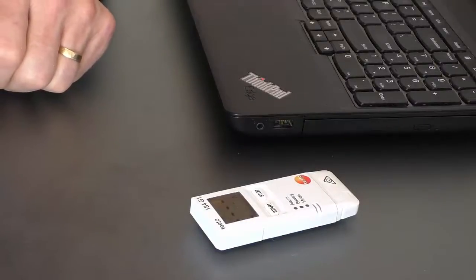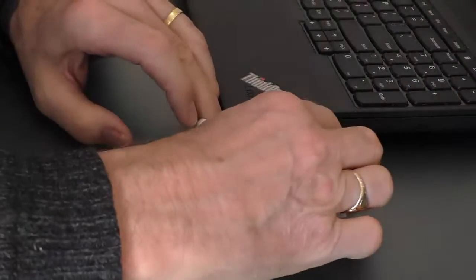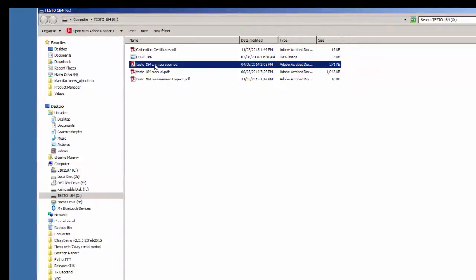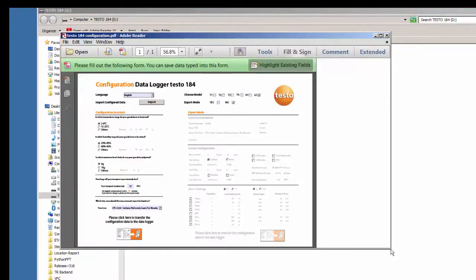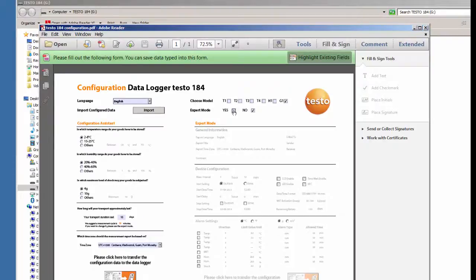To configure the Testo 184G, we simply open it up and plug it into our PC. The PC will pop up a window and we just open a folder to view the files. When it opens, we'll notice there is a Testo 184 configuration PDF, so I'll double click on that. It's opened the PDF and we can see normal mode and expert mode on the right-hand side, so I'm going to select expert mode.